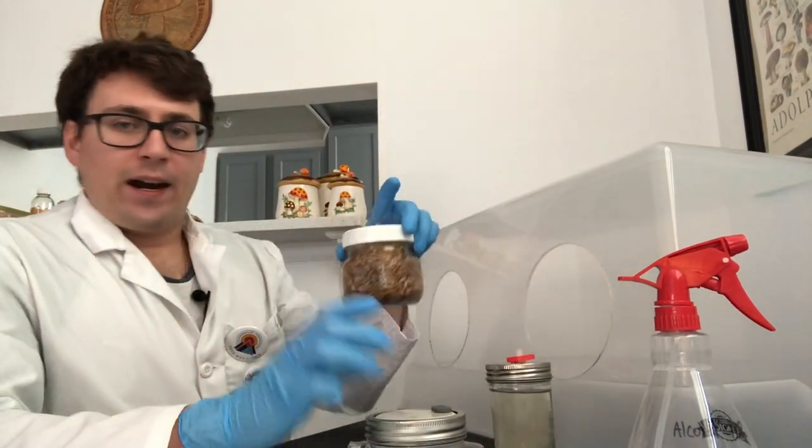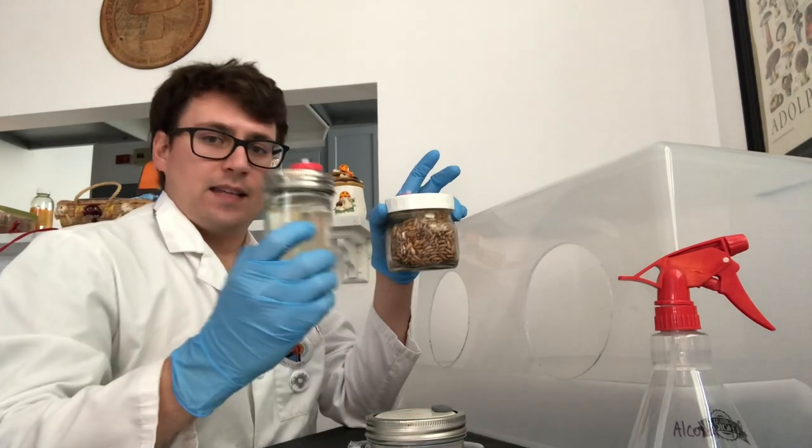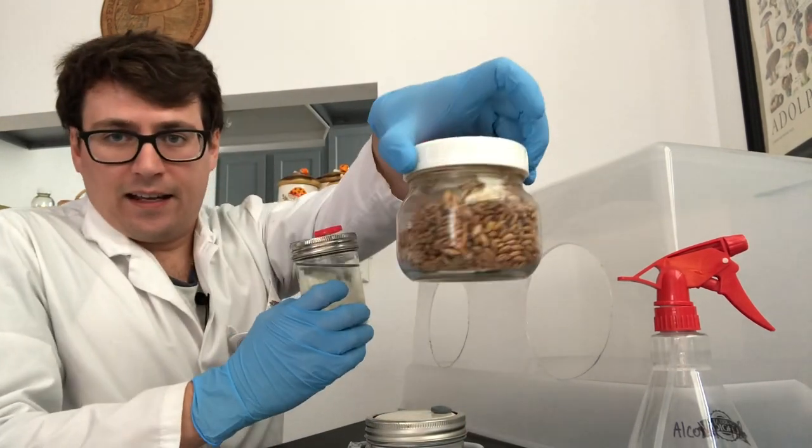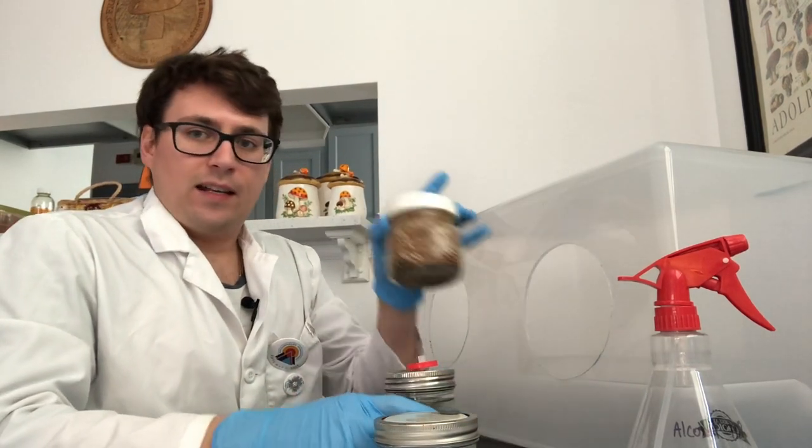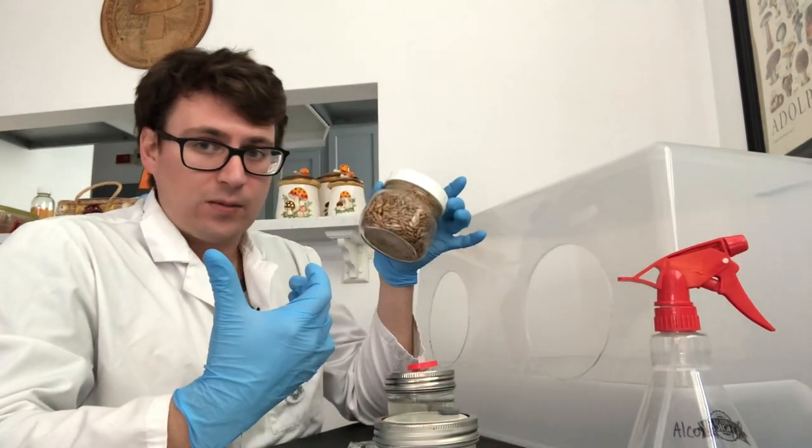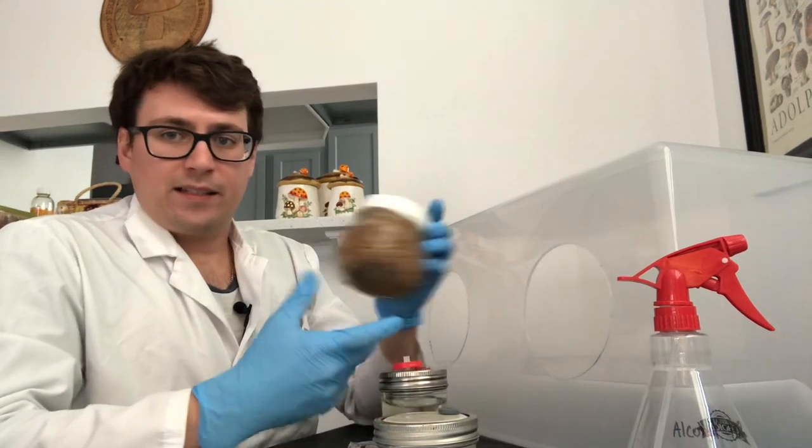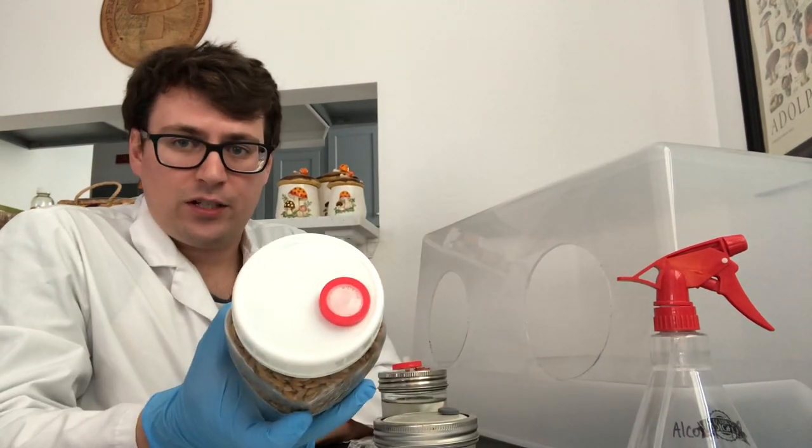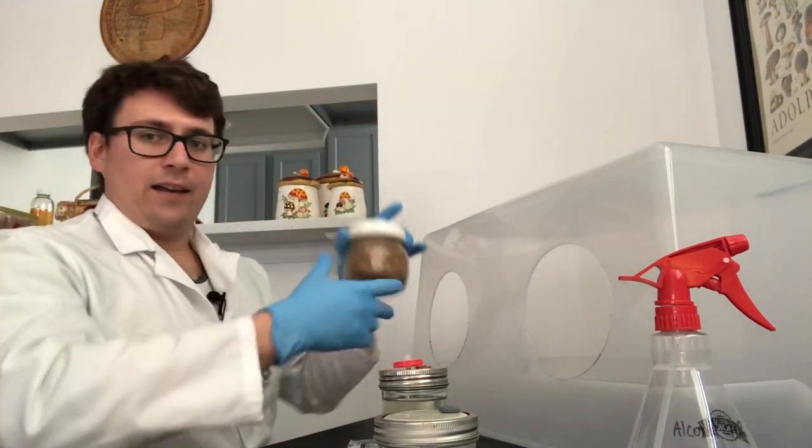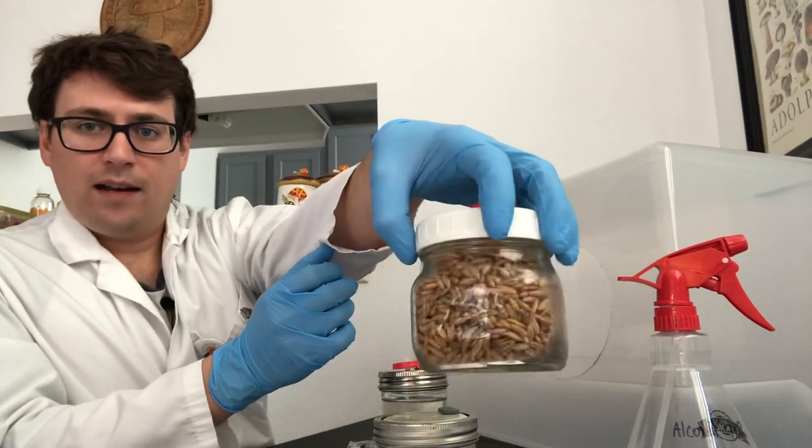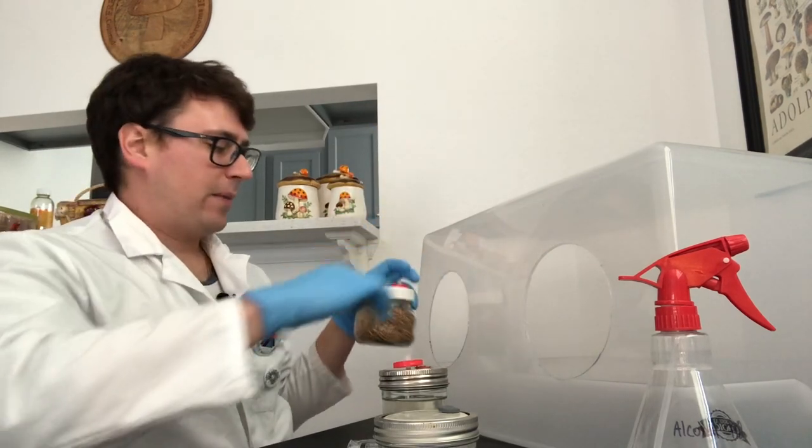Moving ahead from there, you could take your liquid culture and inoculate it into some sterilized grain, so you don't necessarily need a flow hood for that as well. But this lid doesn't have an injection port, so I'm going to demonstrate how I would inoculate a liquid culture into this grain using the still air box.